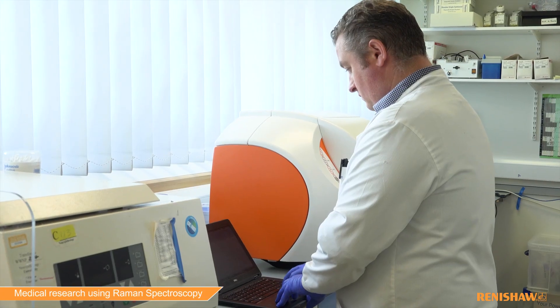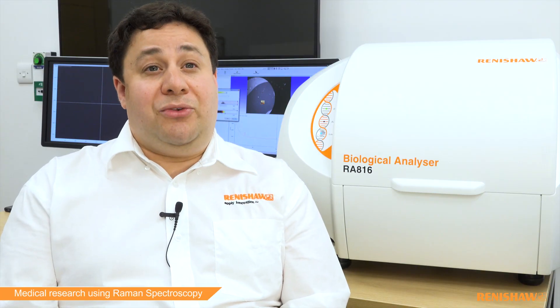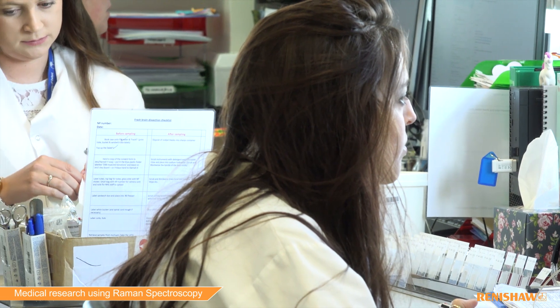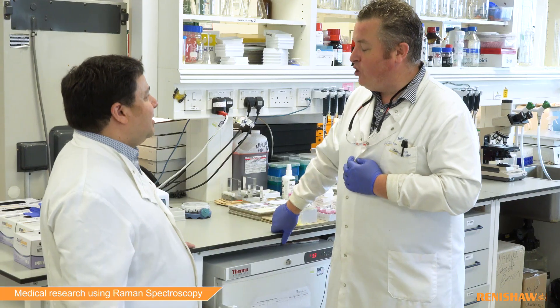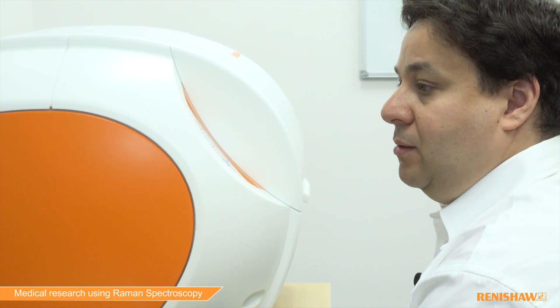The RA816 is making medical diagnostics and imaging accessible to all users without compromising on performance. It is designed to bring confidence in the way you approach clinical research. Renishor has over 25 years of experience in developing Raman technology, and each of our systems are manufactured and tested in the UK.